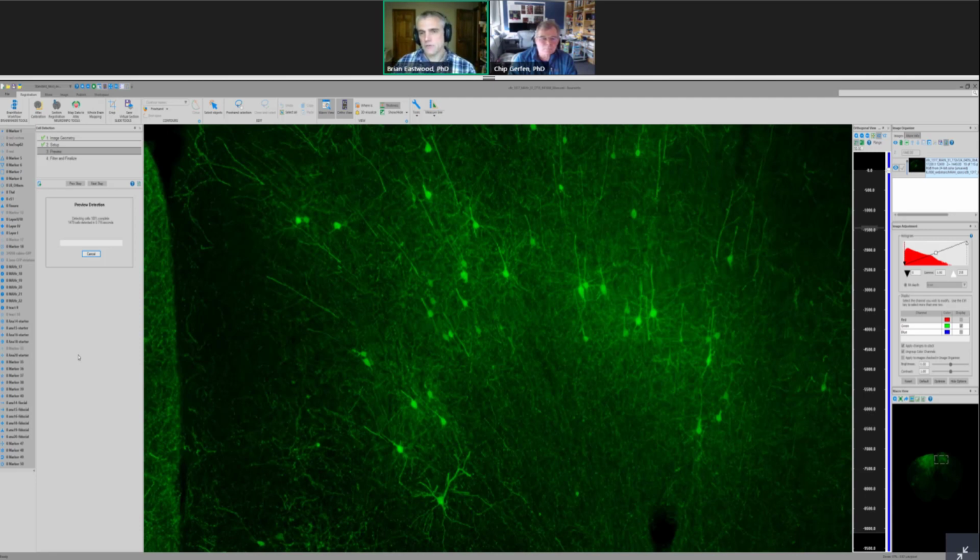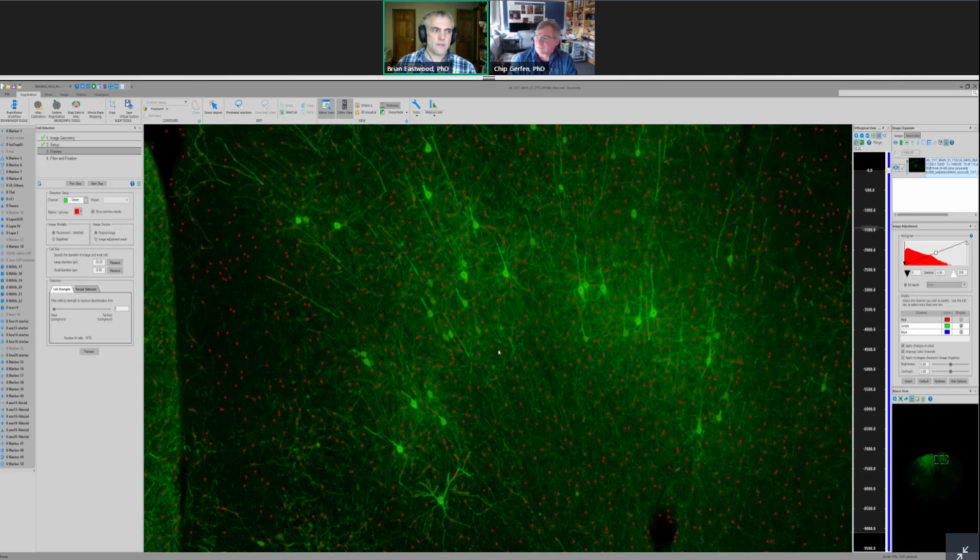The reason that we want to go rather broad with that range of scales is that it sometimes takes a little bit of experimentation to figure out how to get detections that target individual cells. So you get one detection per cell, you don't get double labeling, and you don't end up with many objects that are fused, where you only get a single label for two objects. But a good place to start is the known size of the cells. We have a size range that we expect for pyramidal cells, and then usually going a little bit beyond that is helpful, so that you pick up things that are rather small and things that are big. That is usually a good place to start.